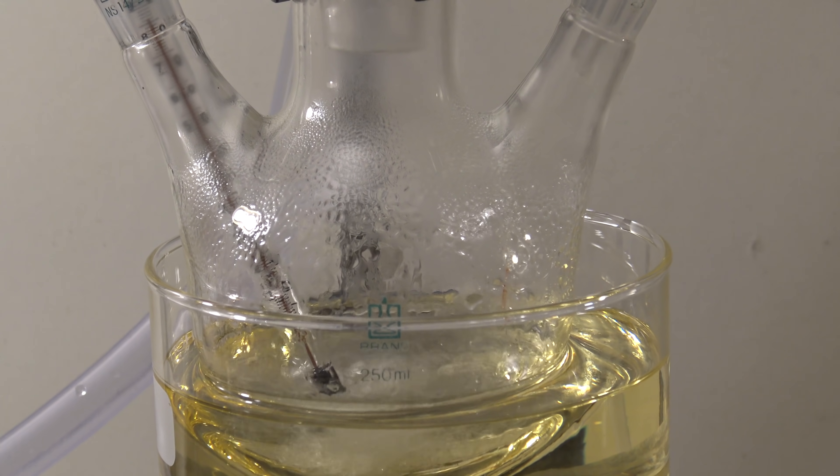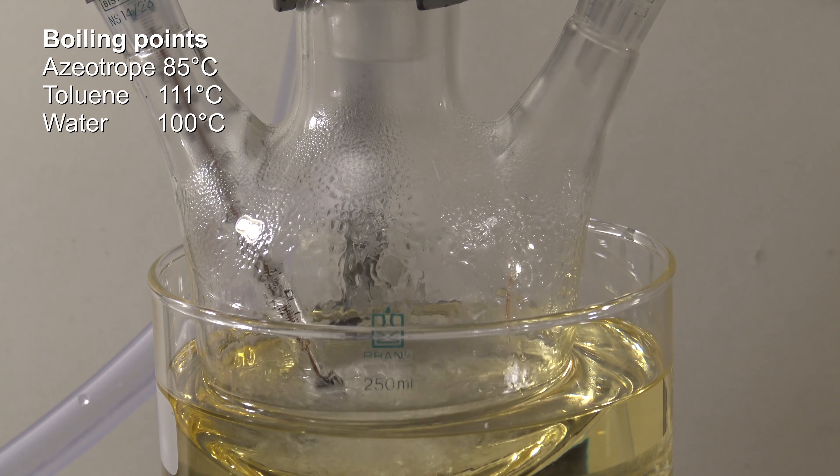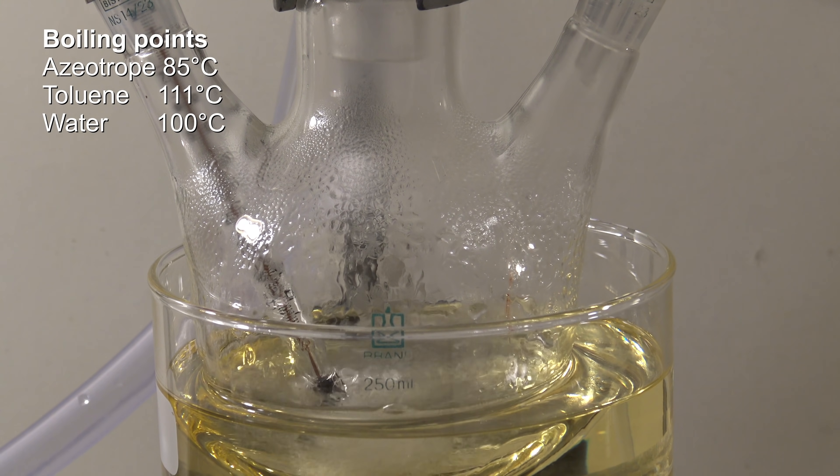Toluene and water do form an azeotrope which boils at 85 degrees Celsius, which is also used to remove water from the reaction mixture in some syntheses.